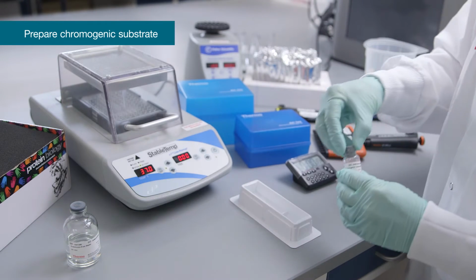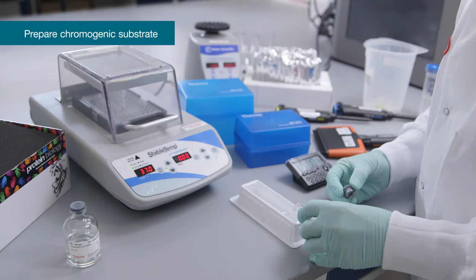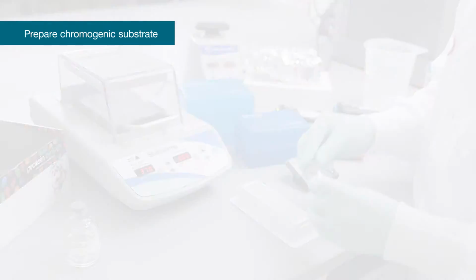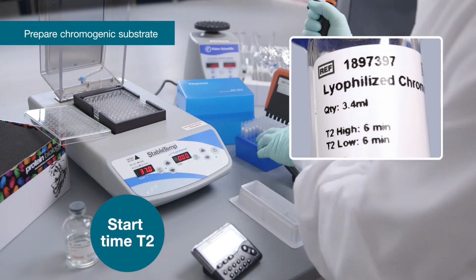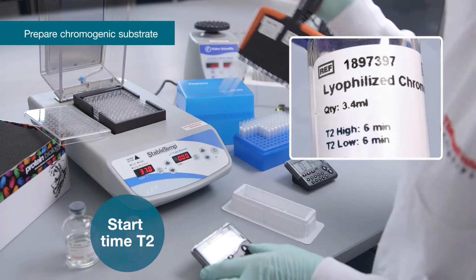When the incubation time with amoebocyte lysate is completed, pour reconstituted warmed chromogenic substrate into the pyrogen-free reservoir, and using a multi-channel pipette, add 100 microliters per well. Note: time T2 of 6 minutes starts with the addition of substrate to the first wells.